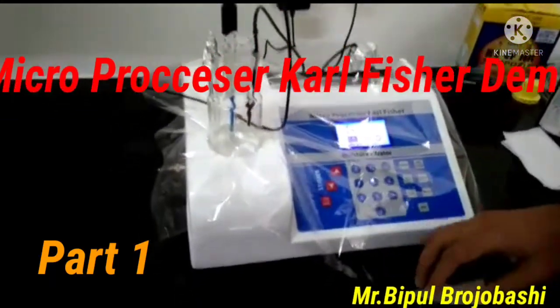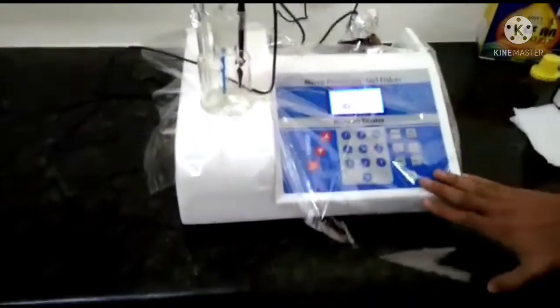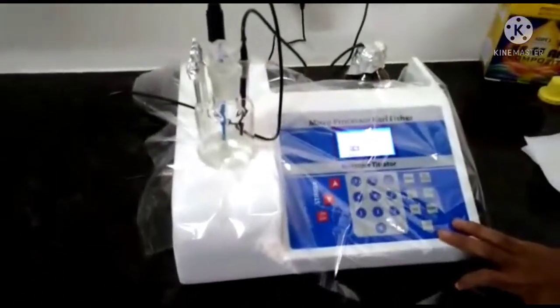Today I am going to demonstrate our microprocessor Fishery Instrument. This is model 6LT630, Electron made.